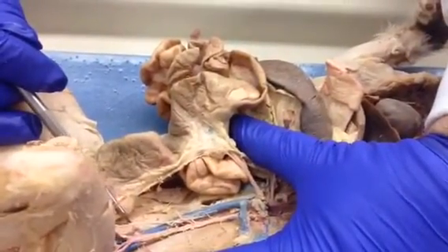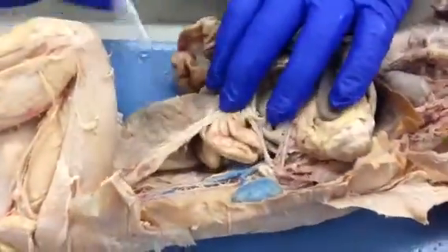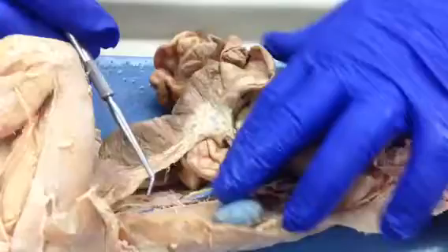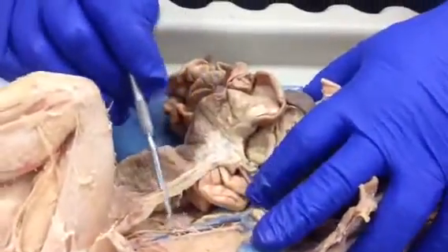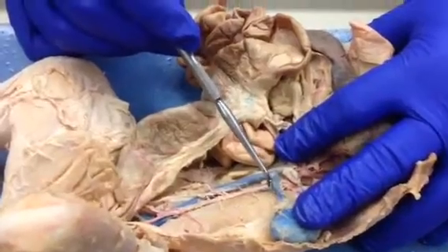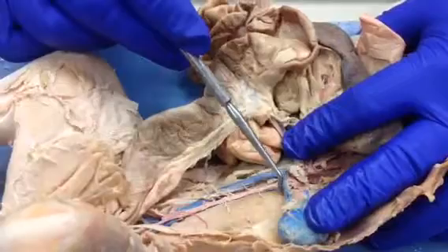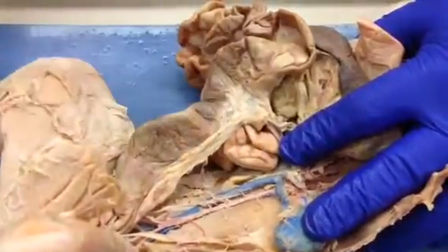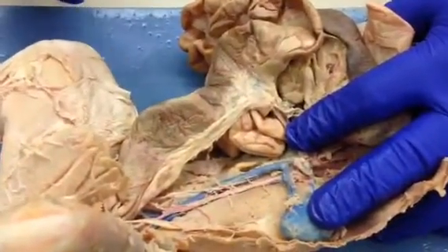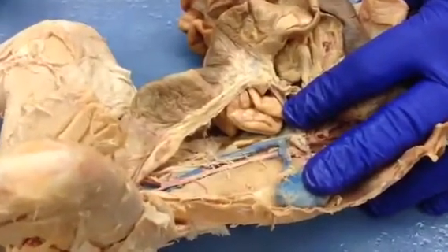That's the iliolumbar, running on top of the ilium. There should be another one right there. The other one you'll find this cat definitely does not have on either side. Well, he has a little remnant here and there, but again, his is so small because he's such a small cat. You would see a vein coming off right here would go down towards the genitals, so go over here to the ovary. So if you see these string ones that are leading over to the gonads, those are the gonadal or genital arteries and veins. Or if you want to be real specific, if it's male, it's testicular. If it's female, it's ovarian.